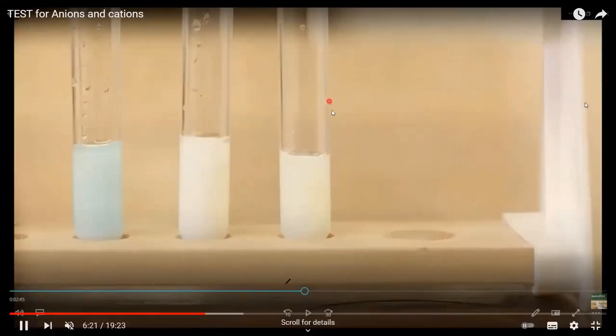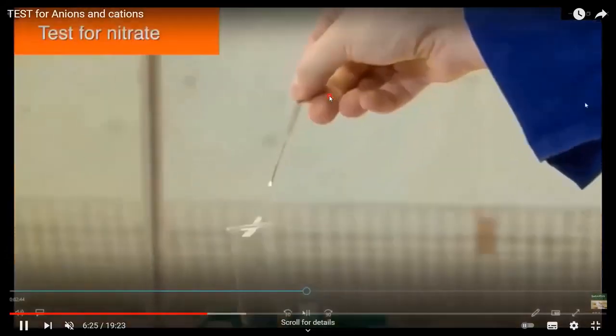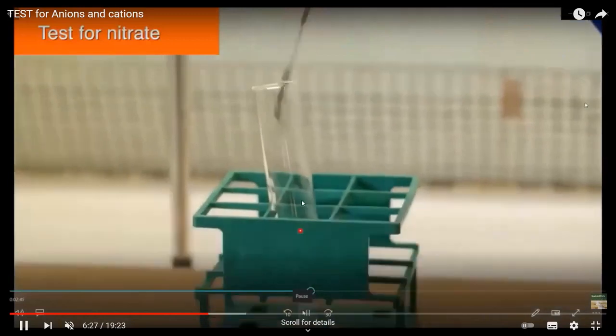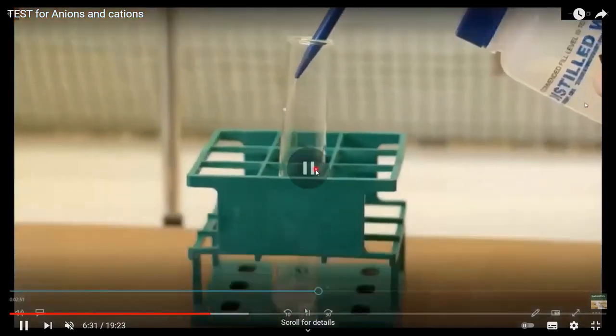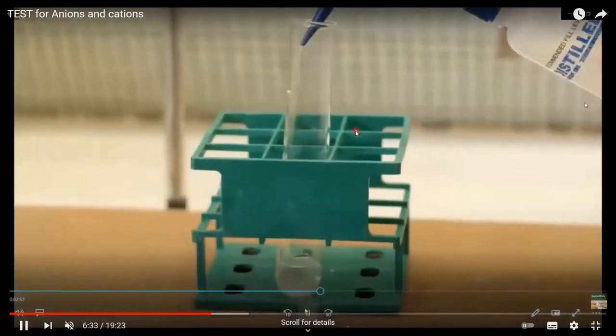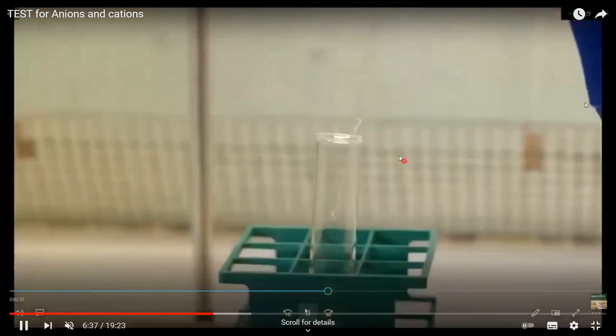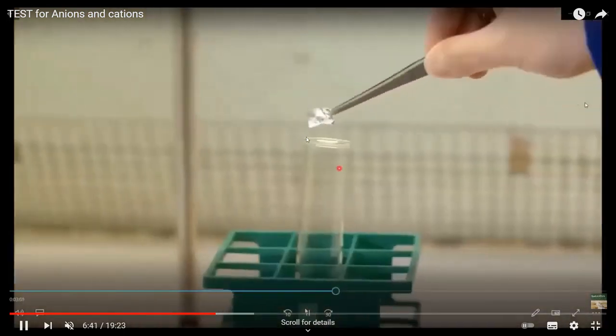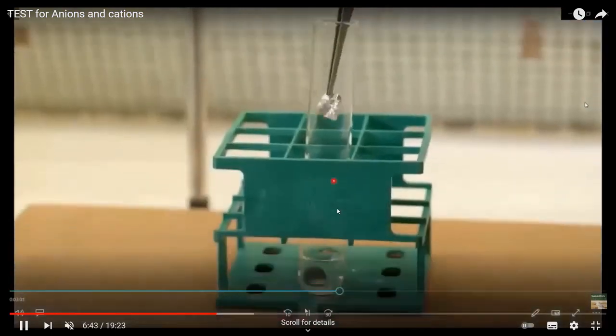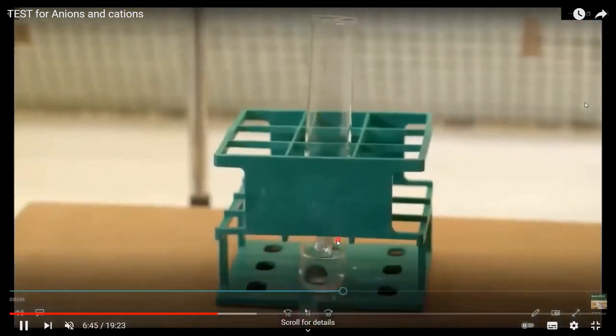Then if we want to test the nitrate ion, so what we do, we have a salt solution. First, always this is done on a salt solution. So first we make a salt solution which contains a nitrate ion. So we'll add sodium hydroxide and aluminum foil can be added. You can see aluminum foil is added here, and then we will heat.